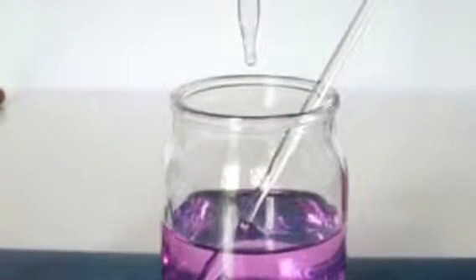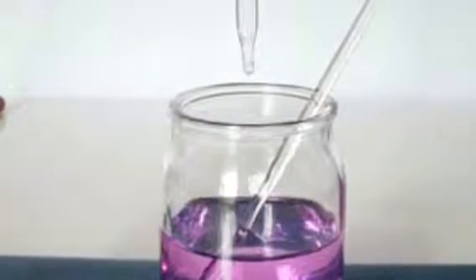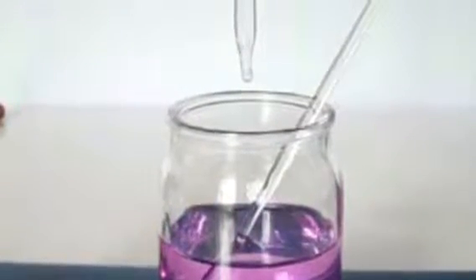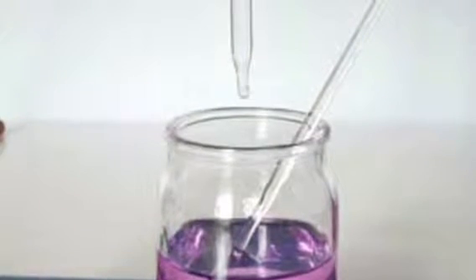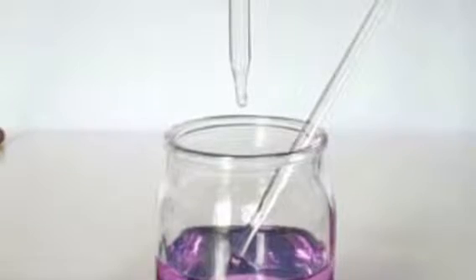Let's first start by defining what a titration is. The purpose of a titration is to quantitatively determine the concentration of an unknown solution called an analyte solution by adding the volume of a chemical with a known concentration called the titrant.